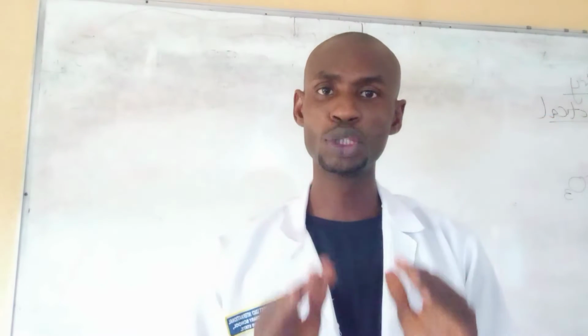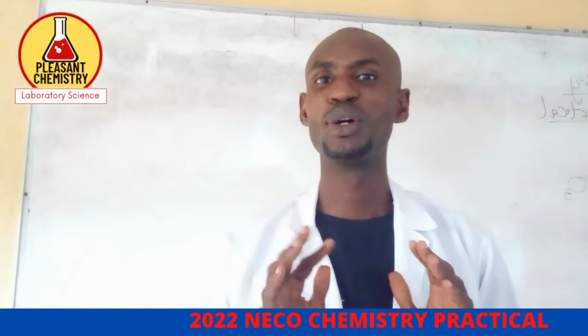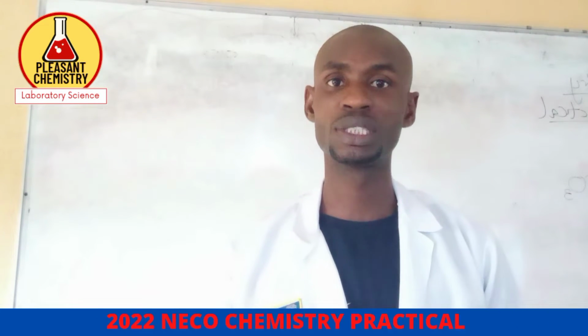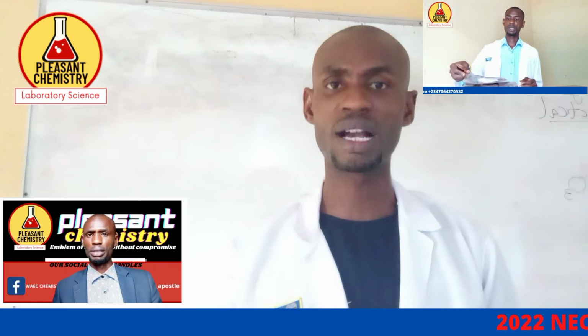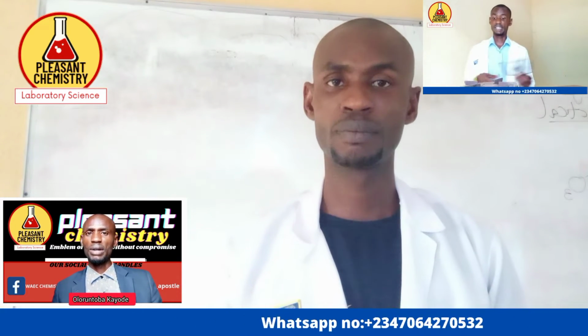Today, we are going to be treating the salt analysis of this year's NECO chemistry practical. We are going to be carrying out the test and the observation, then we are going to treat the questions under it. Likewise, I'm going to display the practical procedure of the test.